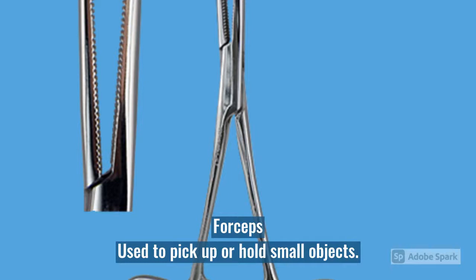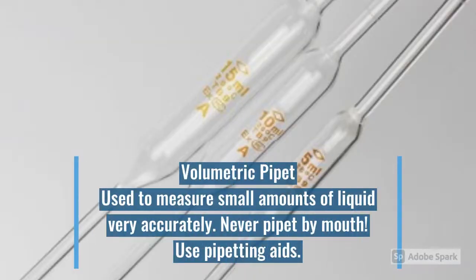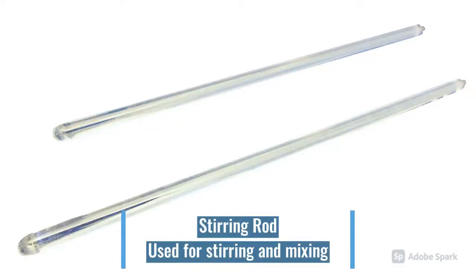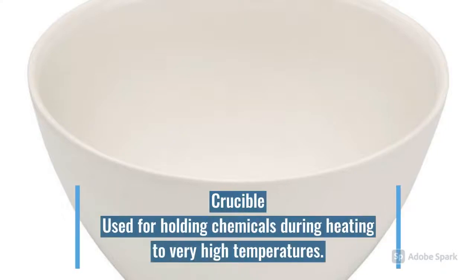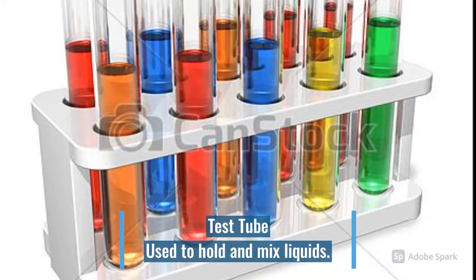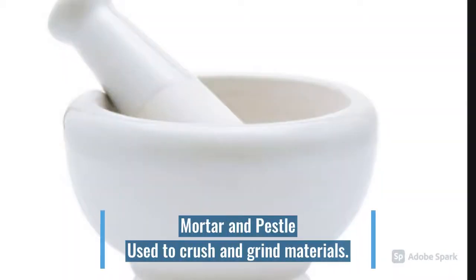For picking, we usually use forceps. A volumetric pipette, used to measure small amounts of liquids very accurately. We also have stirring rods, crucibles, test tubes, as well as mortar and pestle, which is mainly used to crush and grind material.